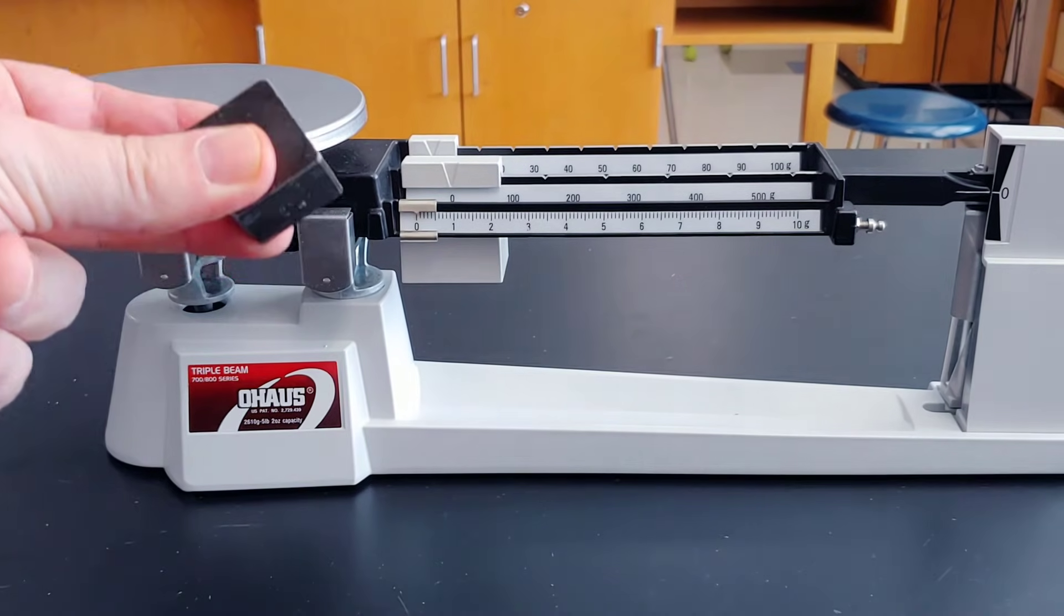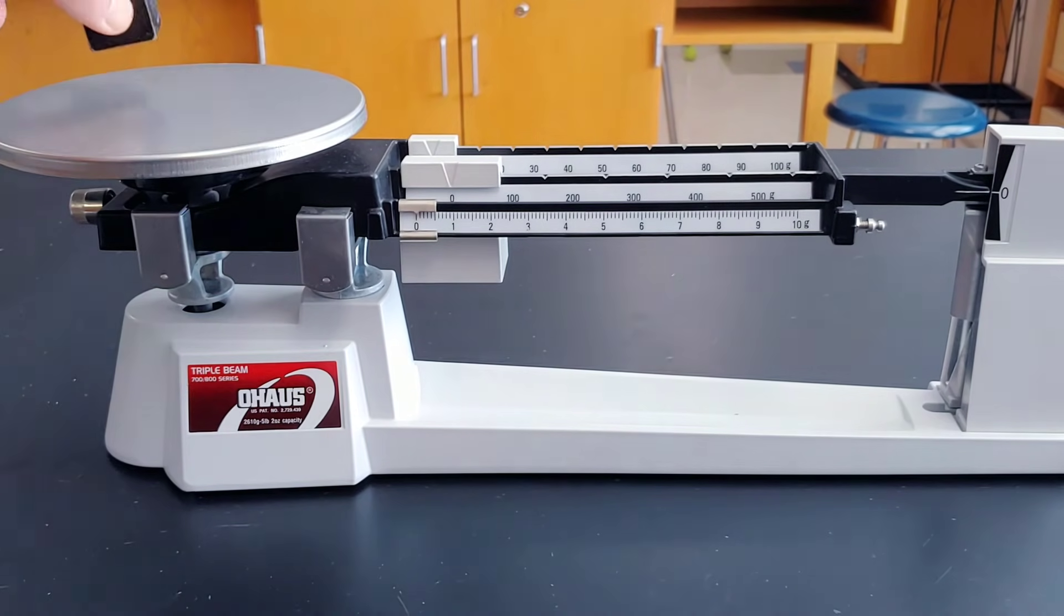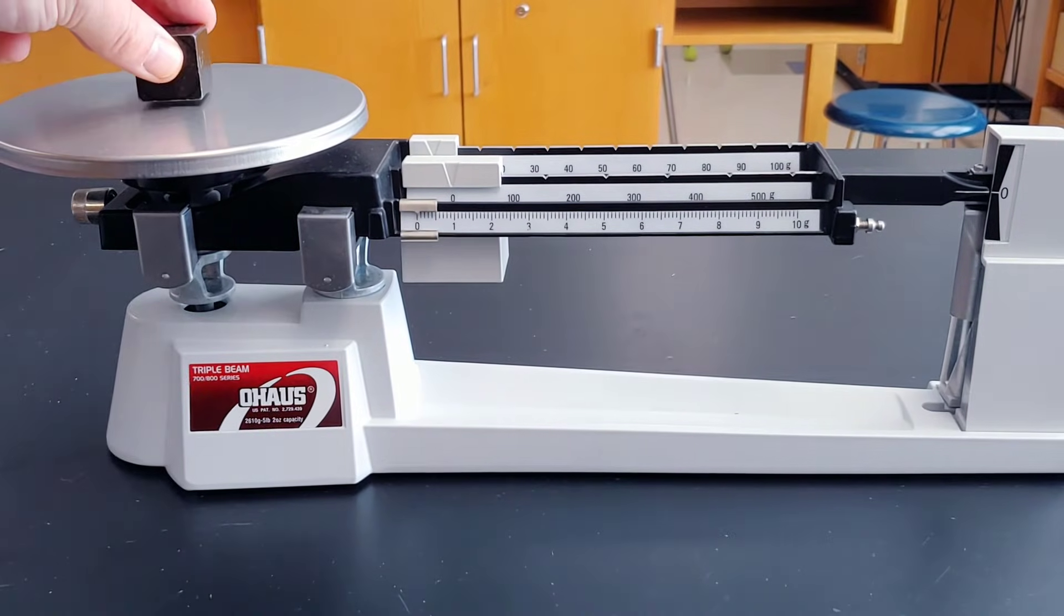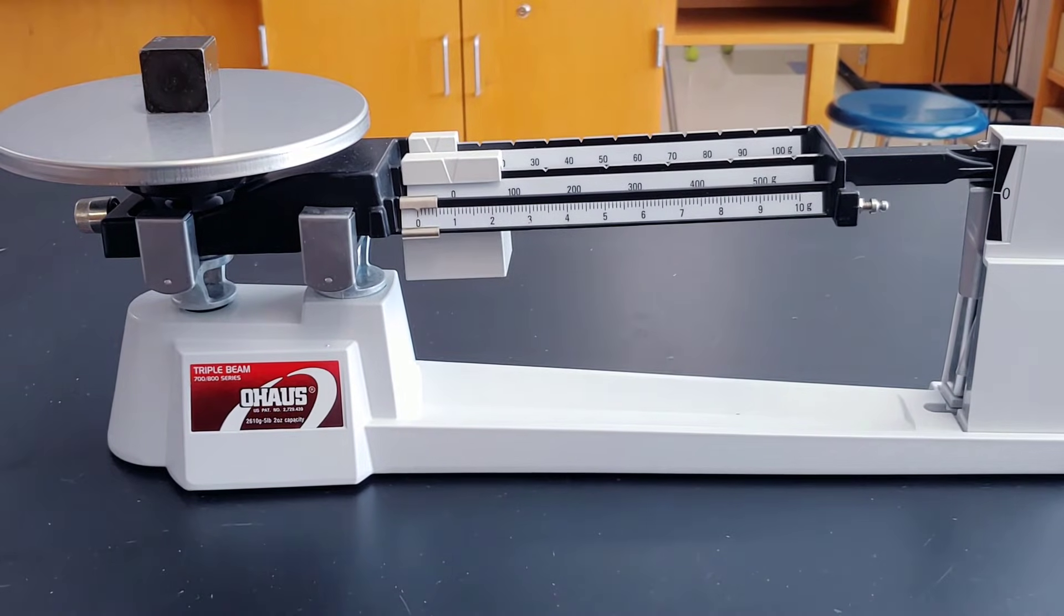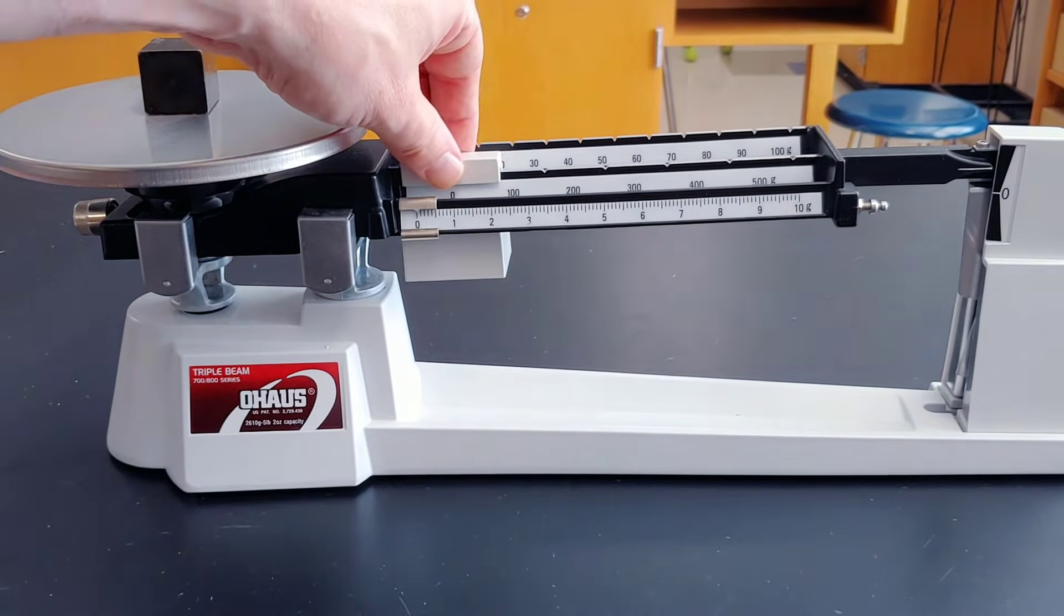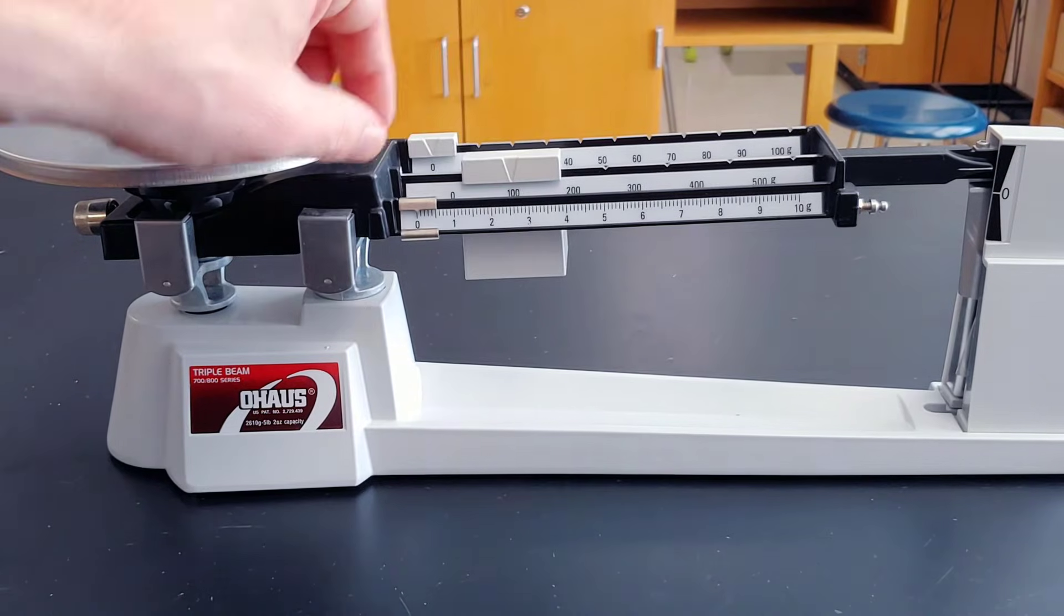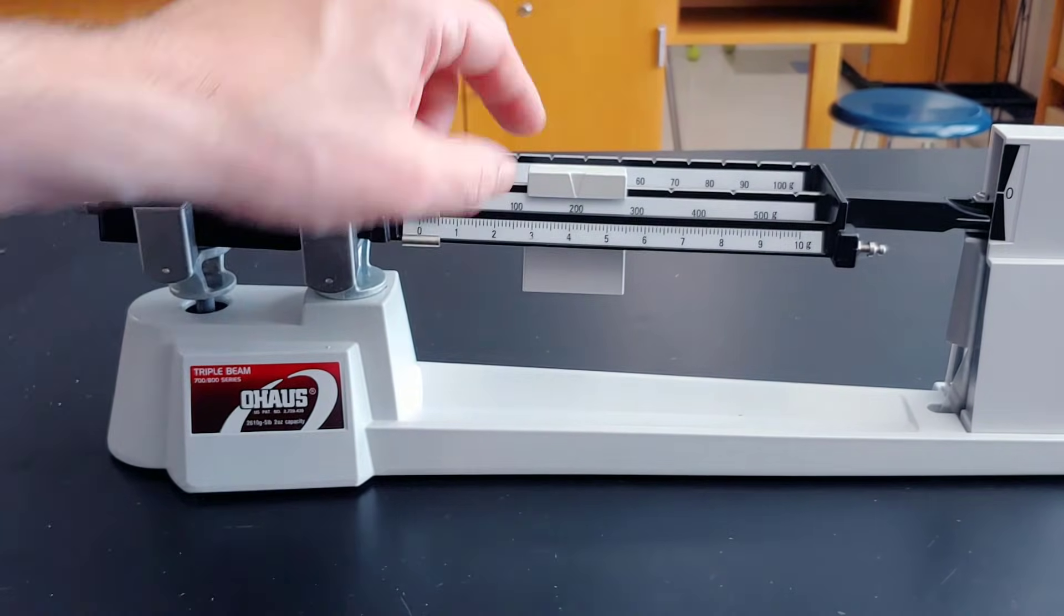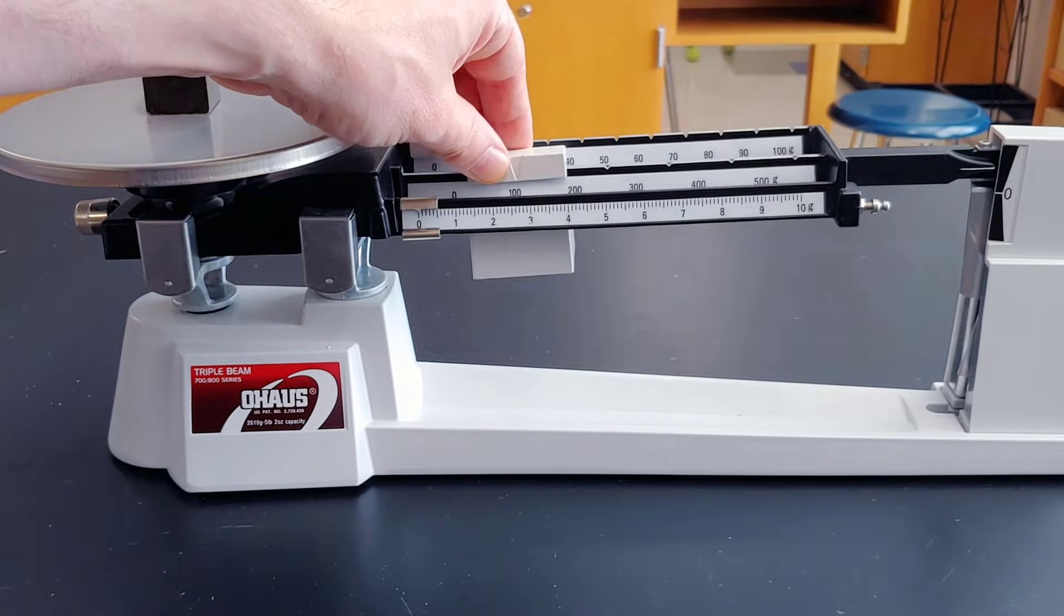Let's measure the mass of this iron cube. We'll begin by making sure it's all zeroed, and we'll place the cube in the middle of the pan. Now we begin with the heaviest arm first. We're going to move it over into that notch. Didn't go down. Over into the notch. And it went down, so we're going to go back to that hundred.